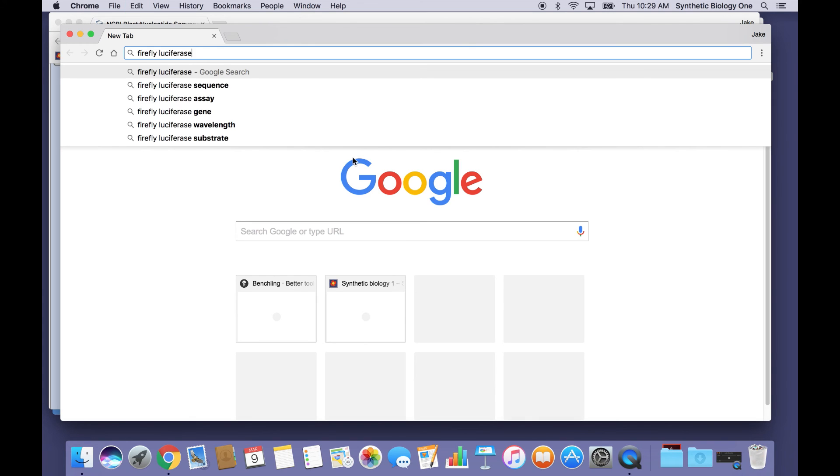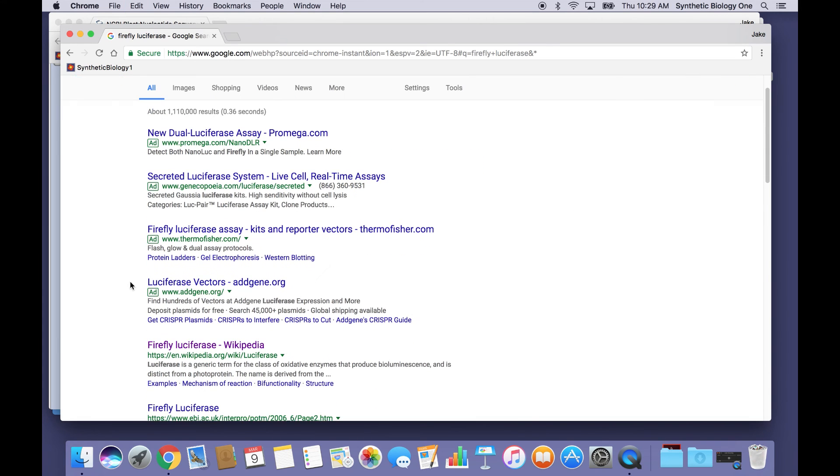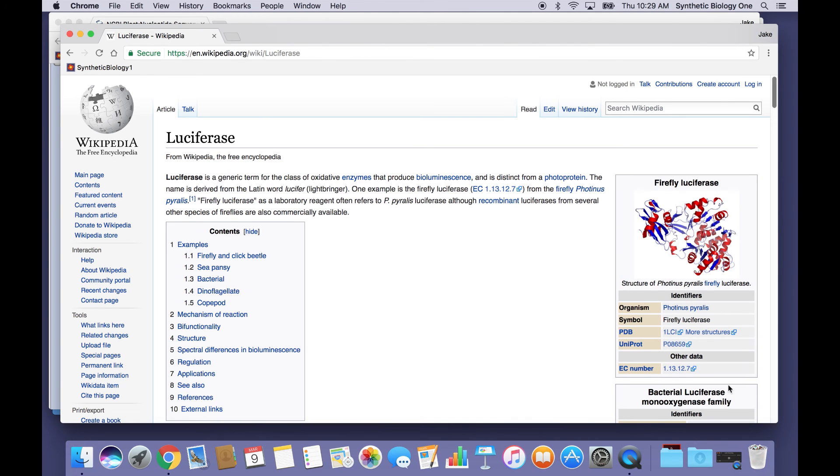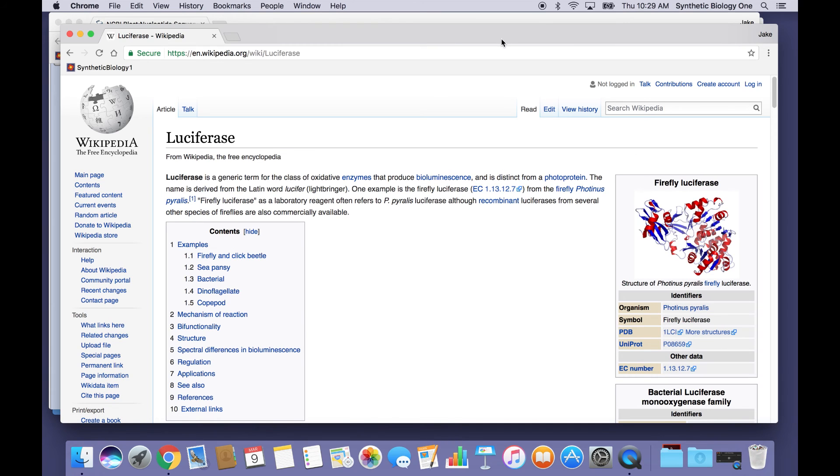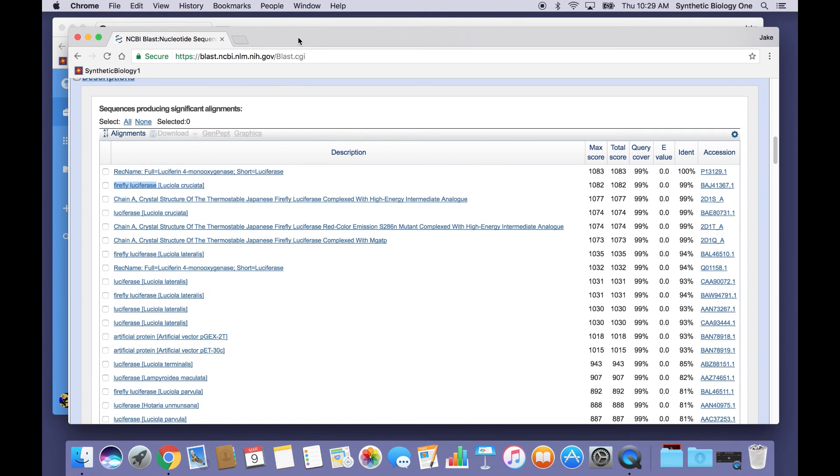And a simple blast search will reveal that firefly luciferase is a very cool enzyme. It's involved in the production of bioluminescence and it catalyzes a chemical reaction that produces light. So that is very cool. We have here a DNA sequence that can produce luciferase and therefore presumably is involved somehow in the production of light.